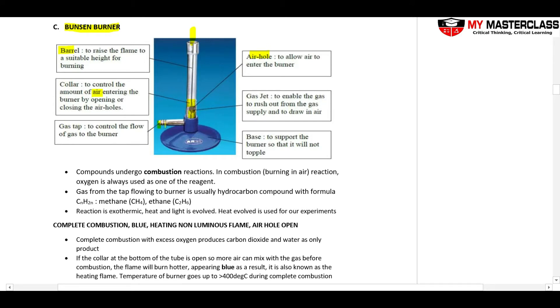This part is connected to a gas tap. In the lab, there will be a hose connected to a tap. When I turn on the tap, gas enters and oxygen enters, and then there will be burning. This opening is also known as the gas jet, which enables gas to rush out from the gas supply and draw in air. The base — the whole blue part — is just for support.